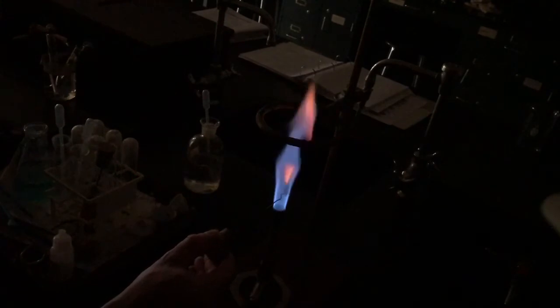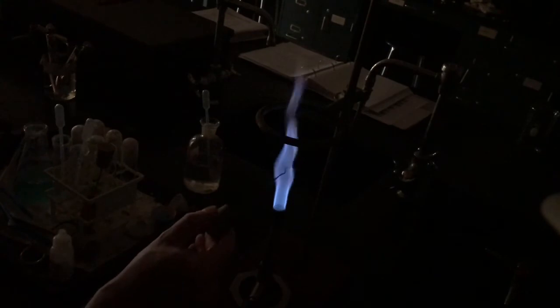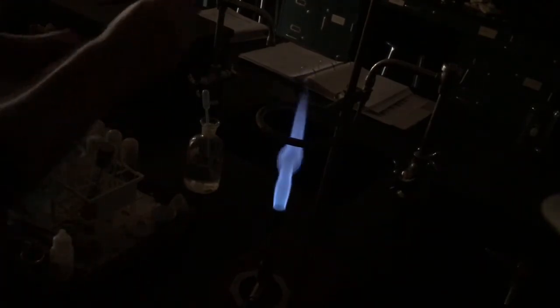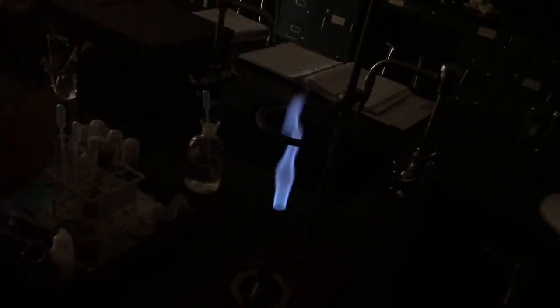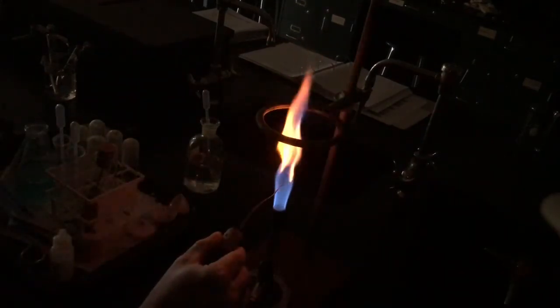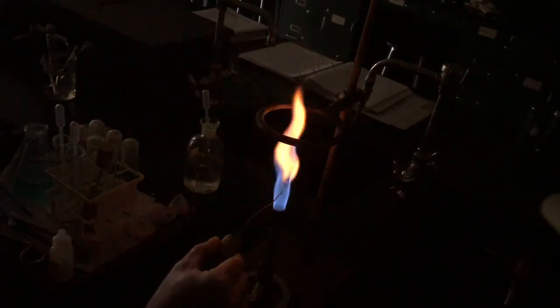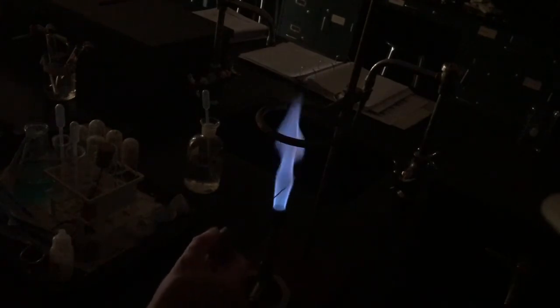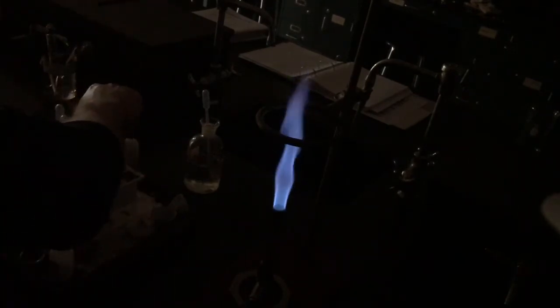It's a reddish orange flame. Let's see if I can get it to go again. There we go. So that's what our calcium flame looks like. And we already know that our unknown does not have calcium in it from our calcium ion test, so we know it's not that one.